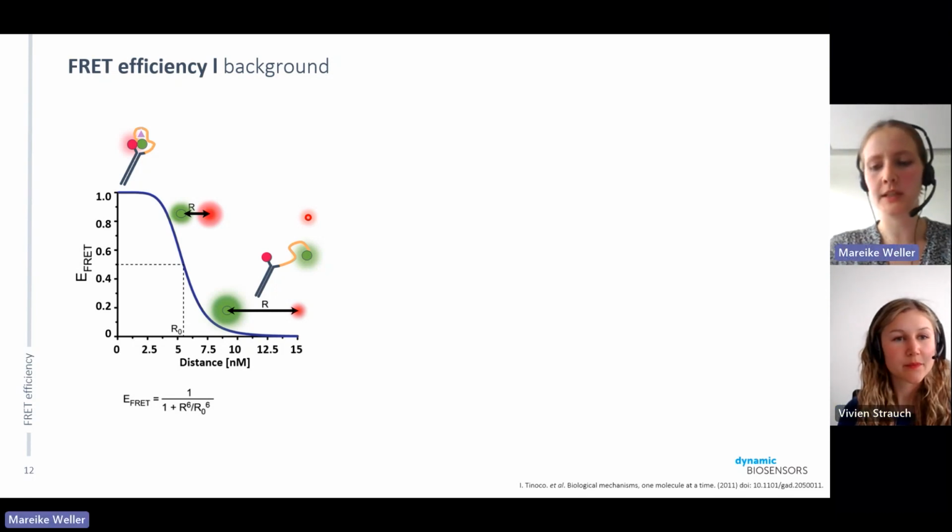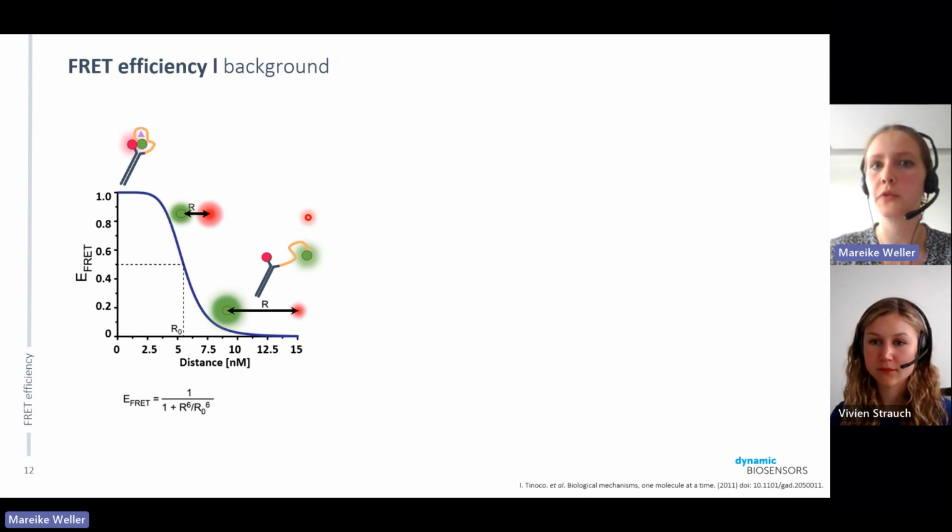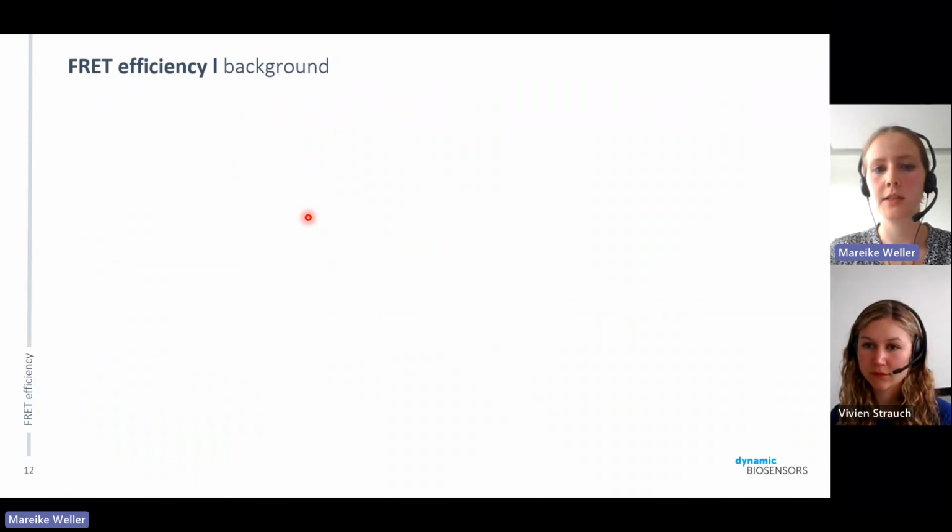For this aptamer, since it's very short, 30 bases, of course you can do first, for example, 2D structure prediction, and also you need to think about at which salt concentration and temperature you measure, which influence the stability of some smaller loops, hairpins, and so on.